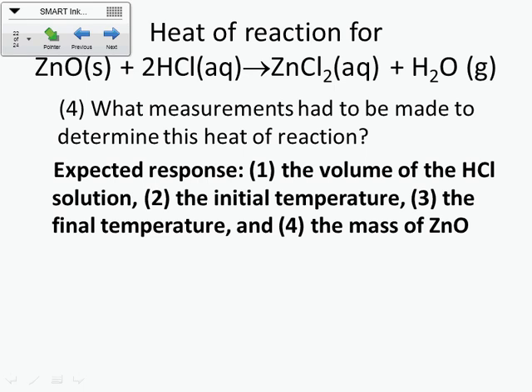Basically, what's happening, now you can see this one right here with the zinc oxide. That starts as a solid. There's really only one spectator, right? What's the spectator? It's the chloride, right? The chloride's really not doing anything, so we're just getting rid of that.